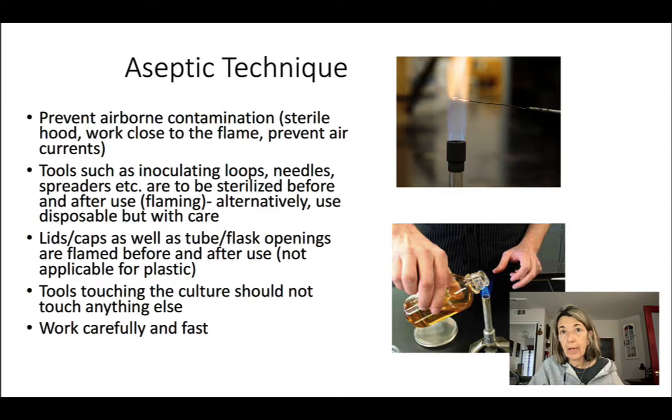Many clinical labs use disposable materials. They are more expensive, but at the same time they reduce the time of application. And these disposable tools are plastic, so clearly they cannot be sterilized. But what it means is that you also have to handle them with care, because if they get contaminated, you have no way to rectify the situation.